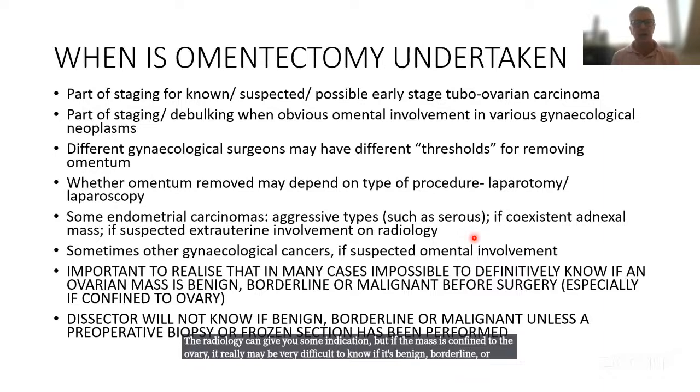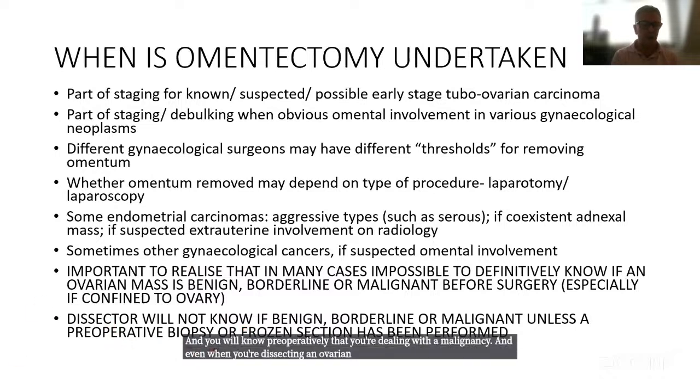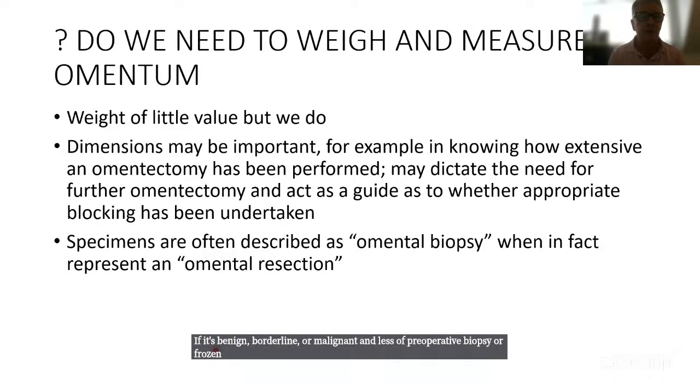This is unlike in other organs, such as the omentum, the endometrium or the cervix, where these are usually biopsied, and you will know preoperatively that you're dealing with a malignancy. Even when you're dissecting an ovarian mass, you probably won't know if it's benign, borderline, or malignant unless a preoperative biopsy or frozen section has been performed.